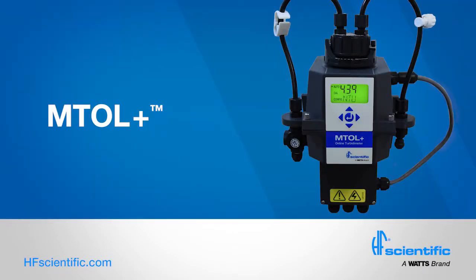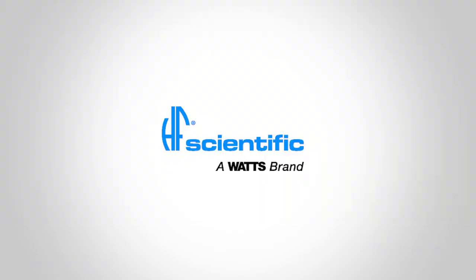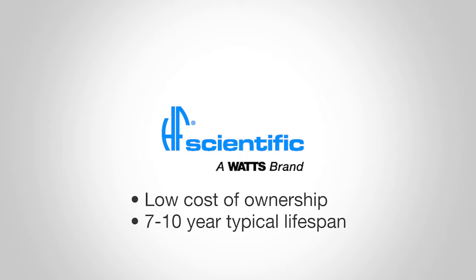HF Scientific has been designing and manufacturing robust, accurate, long-lasting turbidity instrumentation for over 30 years. Our turbidity meters offer low cost of ownership, with typical lifespans of 7 to 10 years.